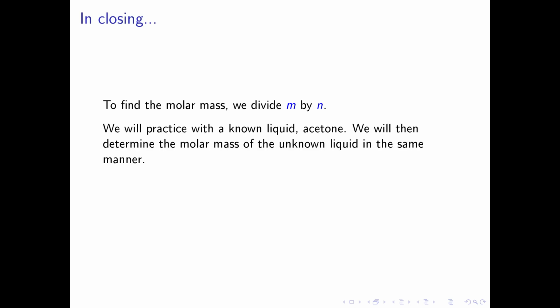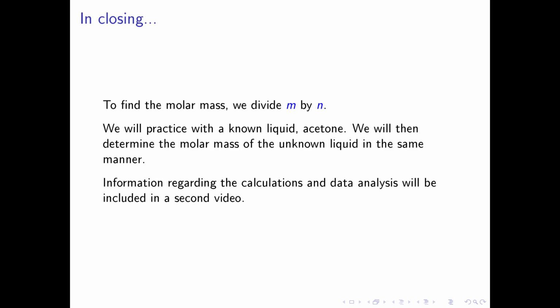We will practice with a known liquid, acetone. Then we will determine the molar mass of the unknown liquid in the same manner. This concludes this introductory lecture. Information regarding the calculations and data analysis will be included in a second video.